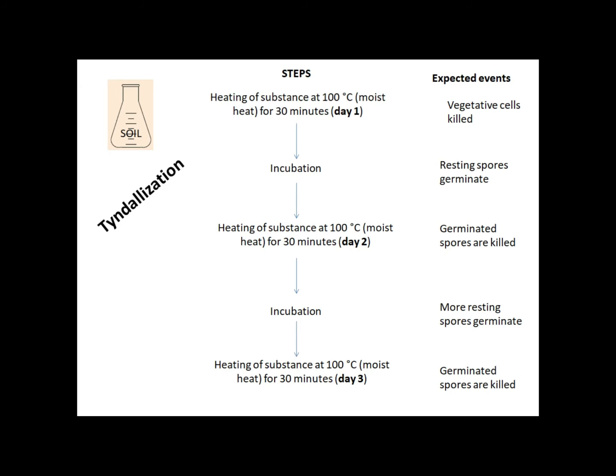In order to ensure complete killing of microbes in the soil, we have to follow the Tyndallization process. A simple sterilization process that is usually done in one day in one step cannot sterilize soil. So we have to follow Tyndallization.